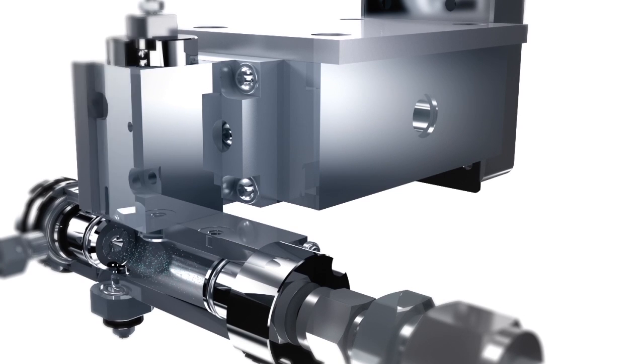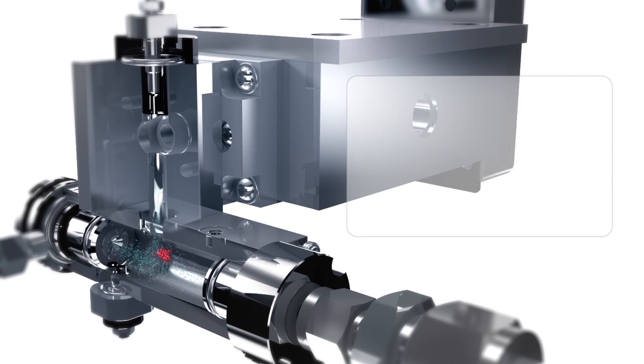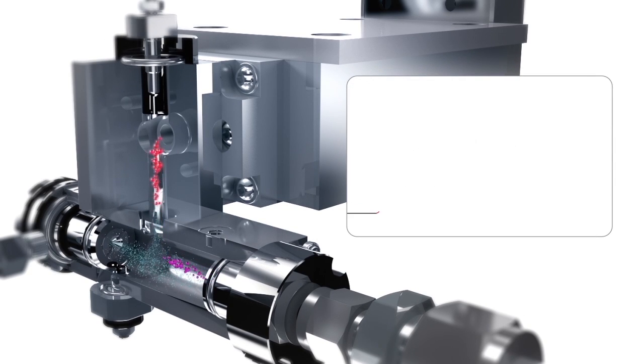Since signal response is independent of chemical structure, the detector provides a near-universal response, allowing for label-free detection of a broad range of analytes.